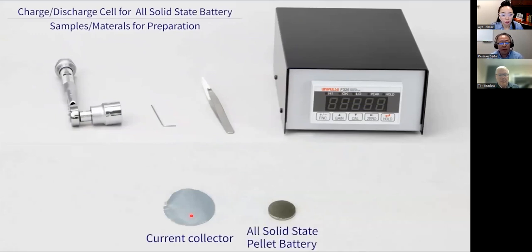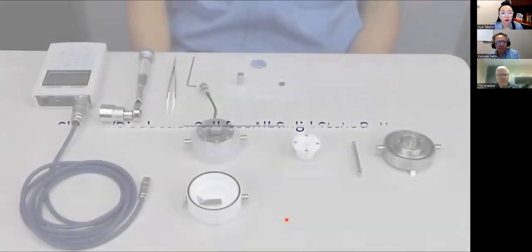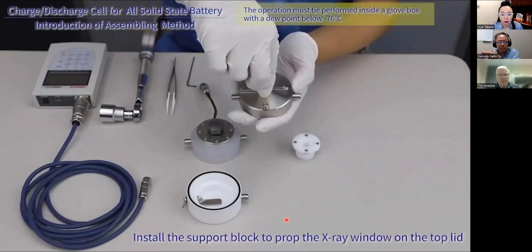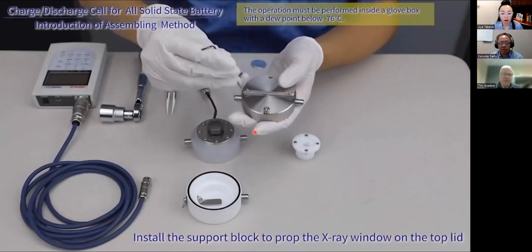So we need to have a current collector, or window for X-ray, typically aluminum. And as I mentioned briefly, we need to have a prepared pellet-style or solid state sample. This means we need to pressurize the cathode, electrolyte, and anode on a separate pressurizing machine to make it a pellet form. So we are putting a support block.